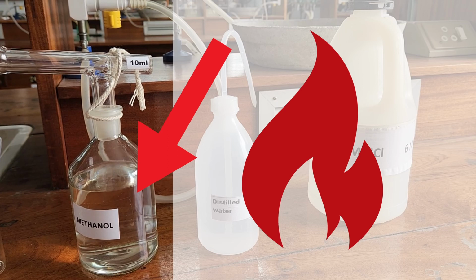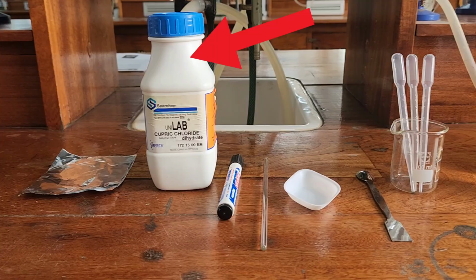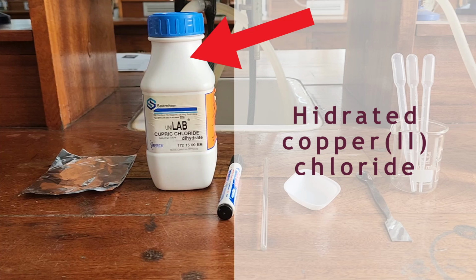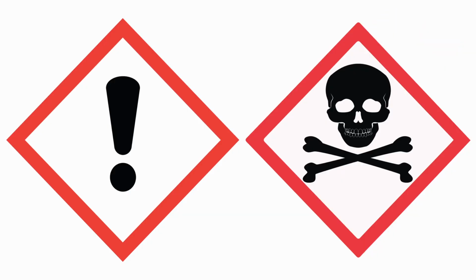Remember, methanol is flammable, so keep it away from any source of ignition such as an open flame. And lastly, hydrated copper chloride. Hydrated copper chloride are blue crystals in flasks next to the mass balancers. Copper compounds are toxic irritants. Handle these compounds with care and wash your hands thoroughly after the practical session. These danger signs appear when picking up different chemicals. See your manual for what they mean.